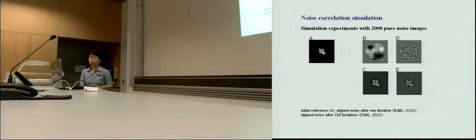Now, the last two slides I want to talk about are just my observations, and I just want to give you the idea of what I'm thinking about. Increase the number of images. People usually say, okay, we should add more images, so we can expect a better result.